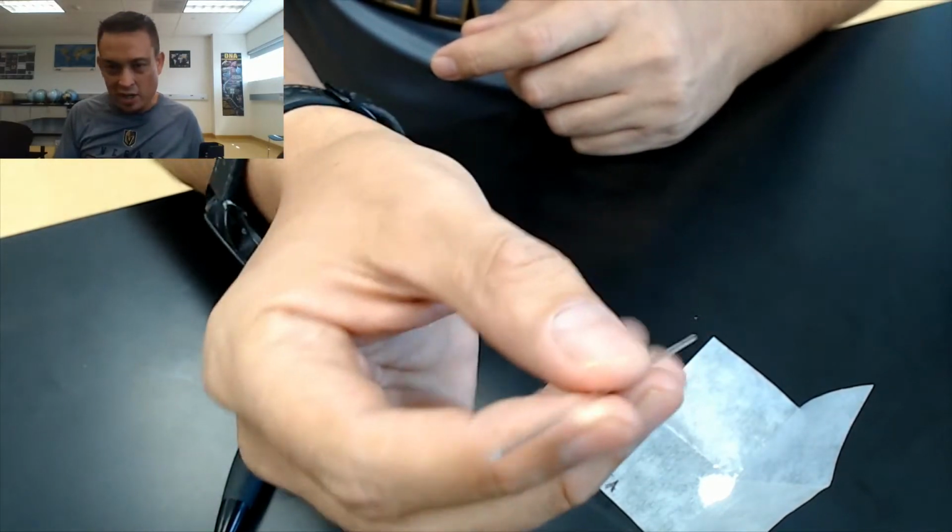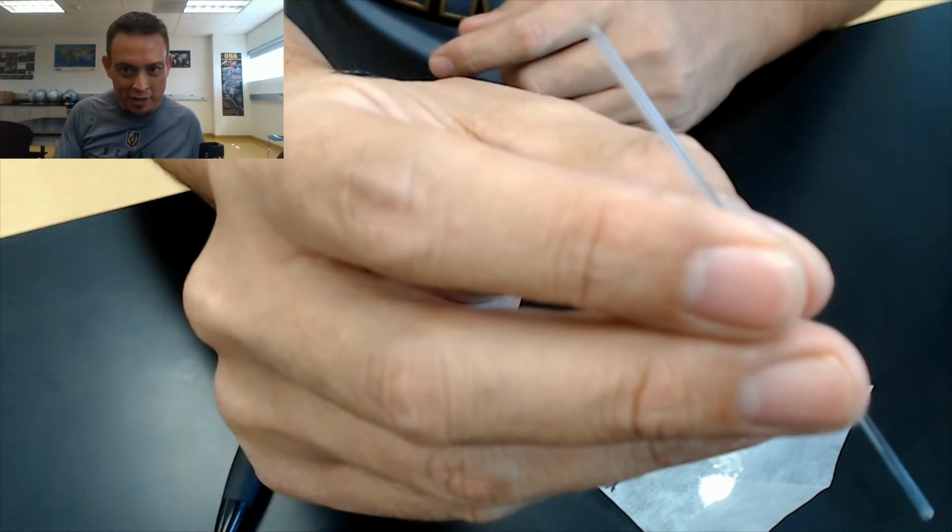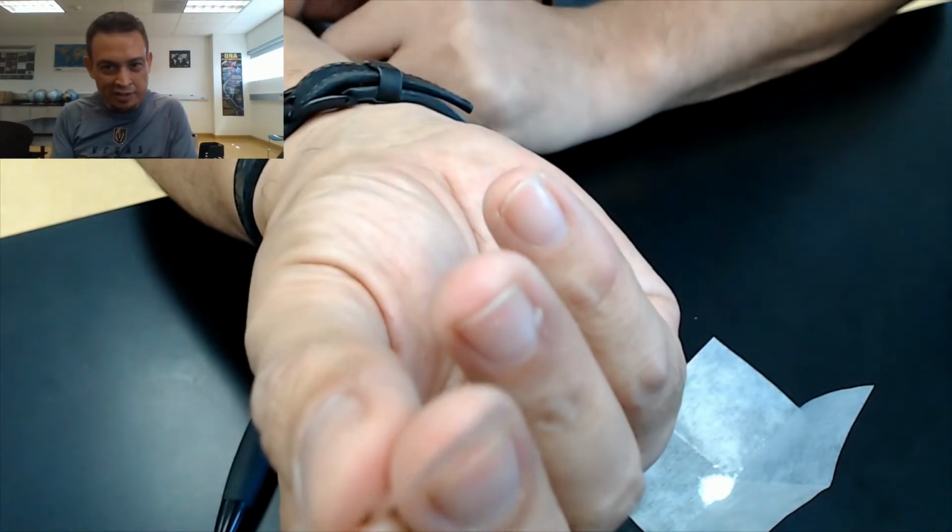So after you have your sample here, oops, I'm not wearing gloves today. Nothing's dangerous here today. So here we have a melting point capillary tube. You may notice here, and I'm showing you really well on the video, but there is a closed end and an open end. So right here is the open end, and then we have a closed end.